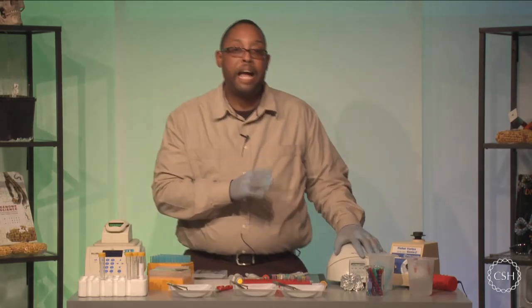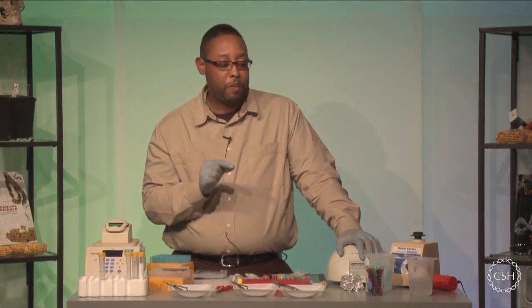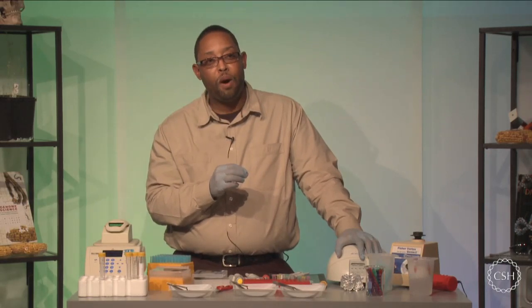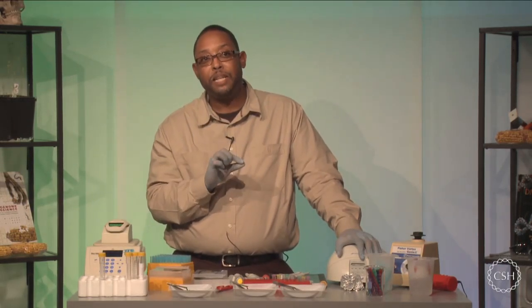Okay. This last spin is going to ensure that our pellet is back down at the bottom of the test tube. And at this point, we're going to try and make sure that when we take off the supernatant or the wash buffer in this final wash step, it's completely off. We're going to make sure that it's as dry as it possibly can get.